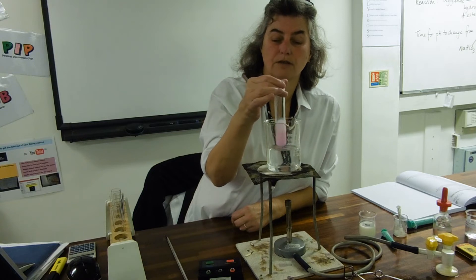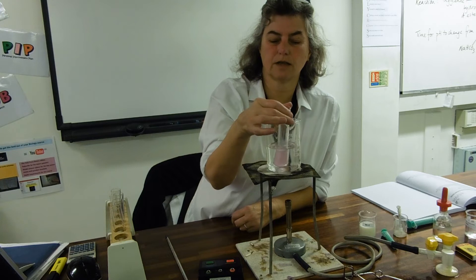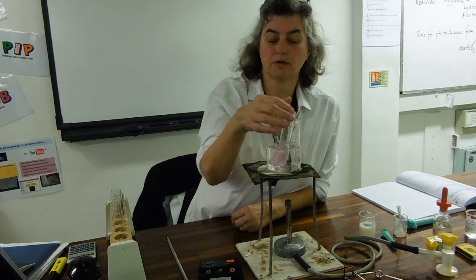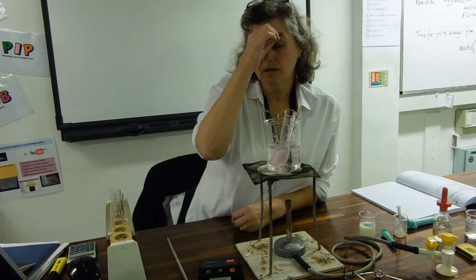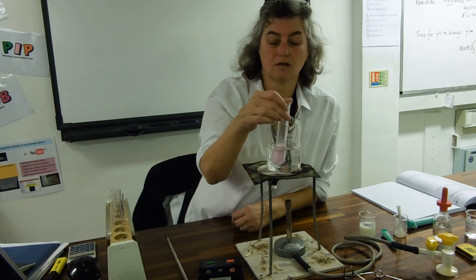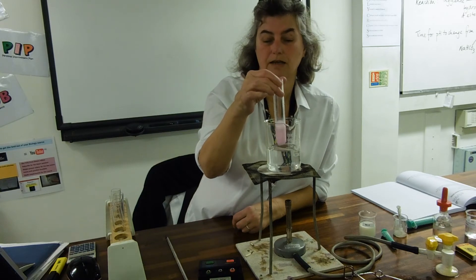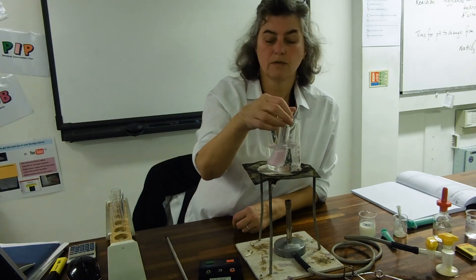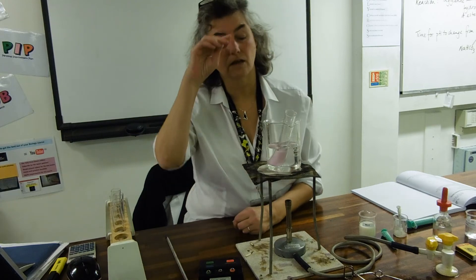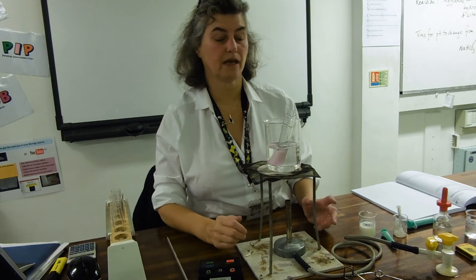One of your evaluation points should certainly be about the subjectivity of the end point — it's when you assess that the solution has actually gone to milk colour. I'm thinking that mine hasn't gone to milk colour yet; it's still quite pink. But as it gets closer and closer towards the milk colour, it gets harder and harder to spot whether it is still pink.